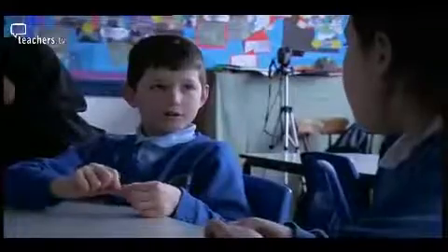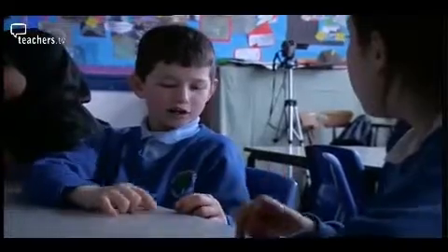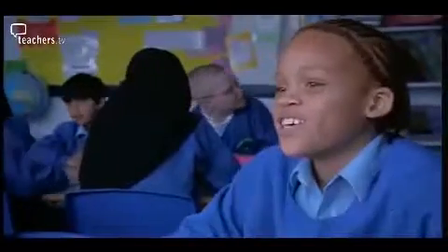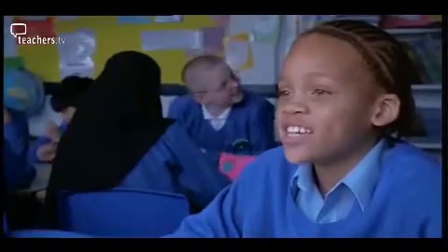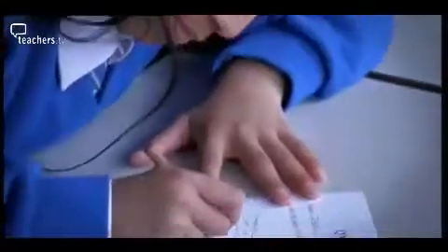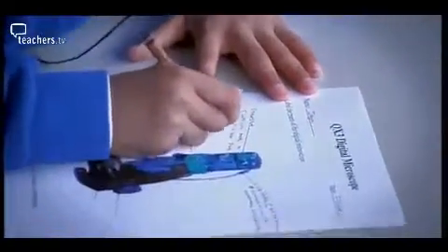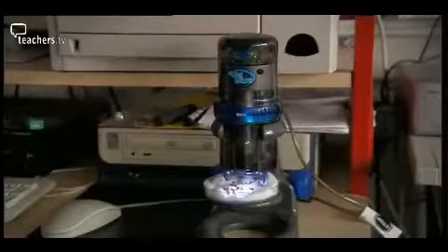How long do you think it will be, Krishna? 2 days. If you leave it for like a minute or two, it'll look really blurry. I think that more than 1 day is too long, but 1 day is just about right. The class decides to set the microscope to take an image every 30 minutes. About 2 weeks. Avril ends the first lesson by asking the children to label diagrams of the microscope.